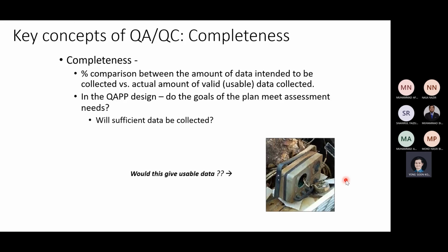errors, like the errors, the mistakes when handling the sample. Some of the samples, when you handle them, are probably exposed to sunlight or to higher temperature for a certain time, then it becomes invalid. So what do you do? You have to eliminate them, because it is no longer valid. So you have to eliminate the samples.